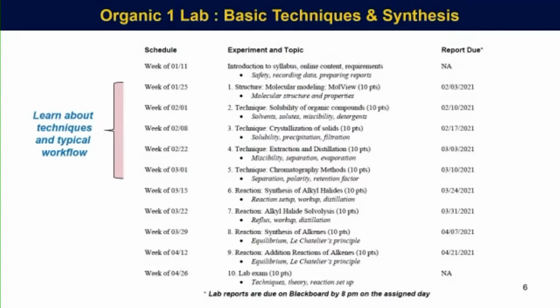Most organic experiments are the same when you go into a research lab. You put things together, you monitor them, you work out if the reaction's finished, you isolate stuff, and then you purify it, and then you characterize it. So we're trying to build a workflow for the students to grab a hold of.